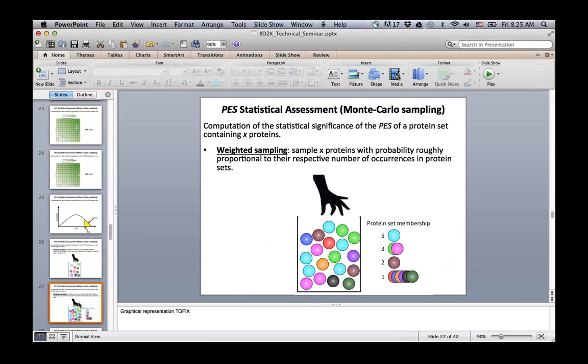Yes, that's a very good point. In the first place, I took good note of your comment. I agree it's a good idea to put the sample output file, and I will do that as soon as possible. Your second point is also very true. It is a confounder. There are proteins that are simply more likely to be abundant than others because they fly better than others.